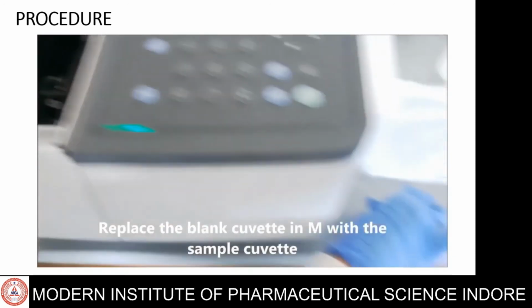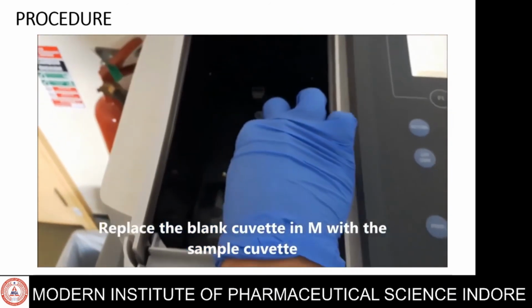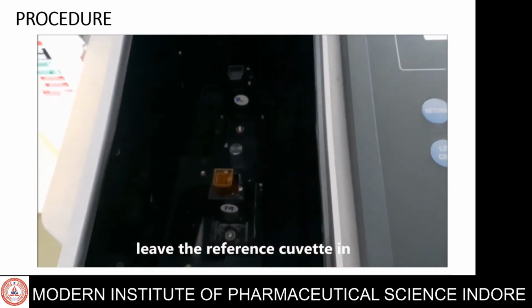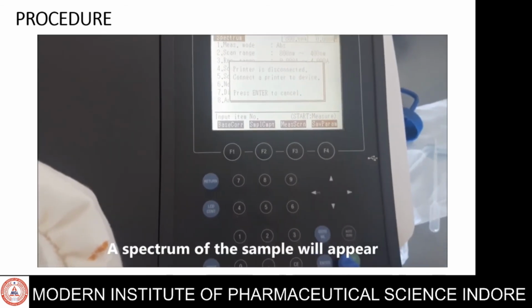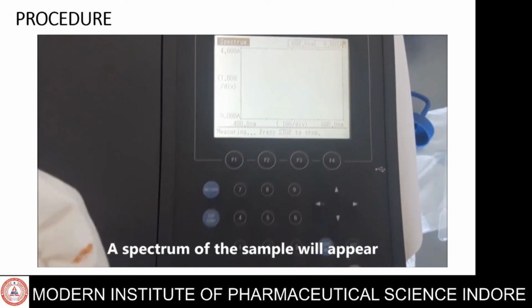Replace the blank cuvette with the sample cuvette. Leave the reference cuvette in. Press start to run the sample after baseline correction. A spectrum of the sample will appear, the spectra of our sample like this.